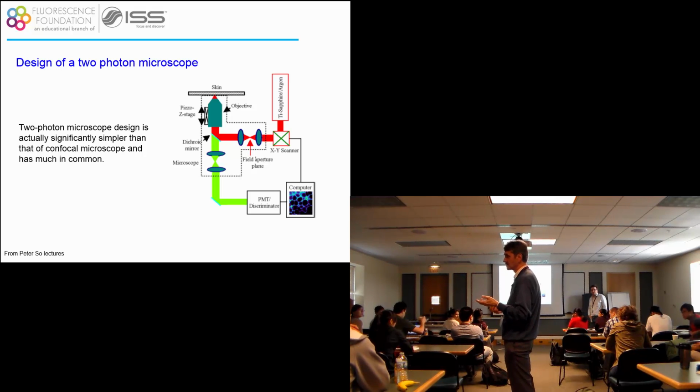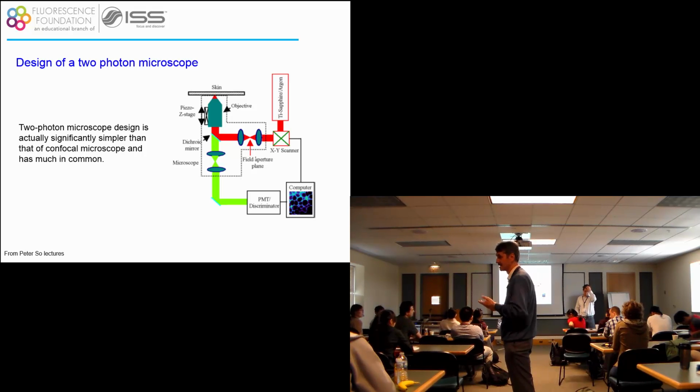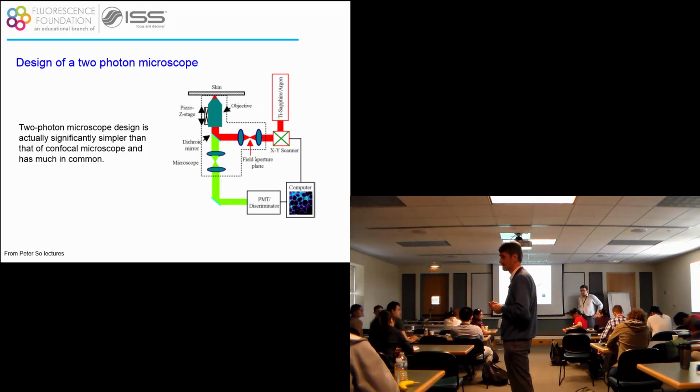At the end, what is important is the signal to noise ratio, so how many photons you acquire. For some analysis, like FLIM, fluorescence lifetime, you need at least 1,000 photons per pixel. So you acquire an image fairly fast, and then you keep acquiring images. Now there are ways to acquire faster images. In fact, there are microscopes with galvo resonators. You can acquire even 1,000 frames per second. Then of course there are the CCD cameras, which are also fairly fast. So you can get 1,000 frames per second as you're scanning?